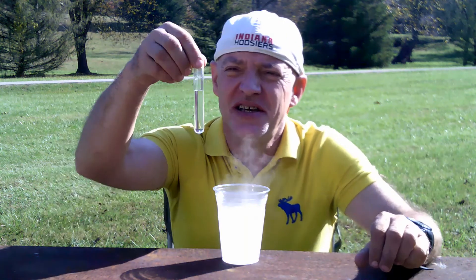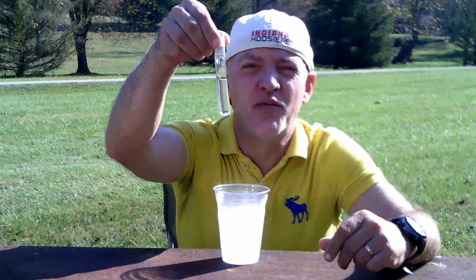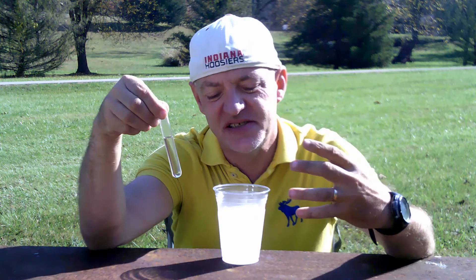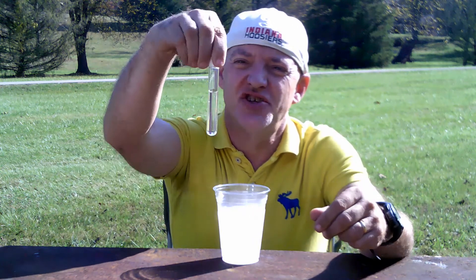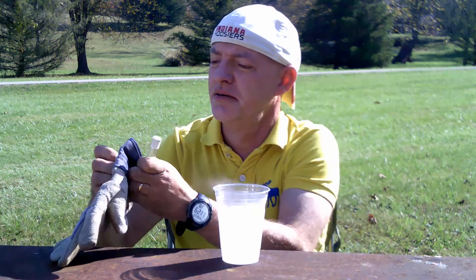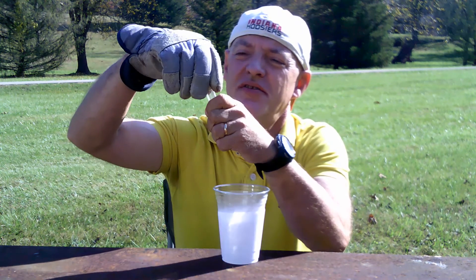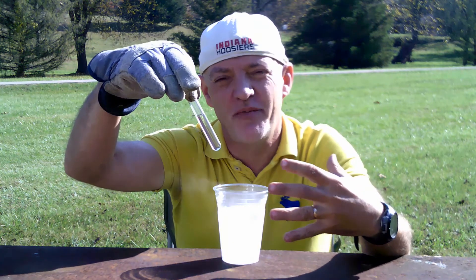Hi. Today we're going to be doing a science experiment to see how quickly a small amount of water inside a test tube can freeze in liquid nitrogen. I've got just a small amount of water here and I'm going to put the water into the container of liquid nitrogen.